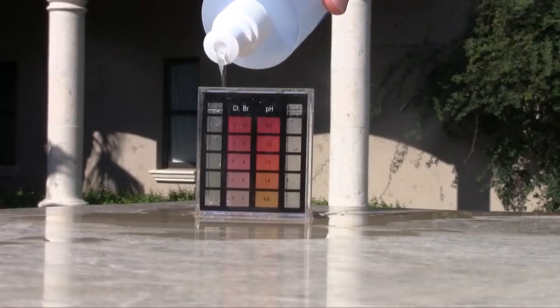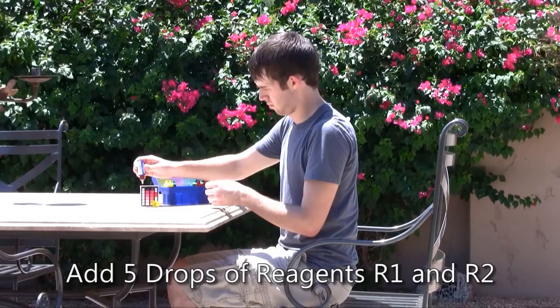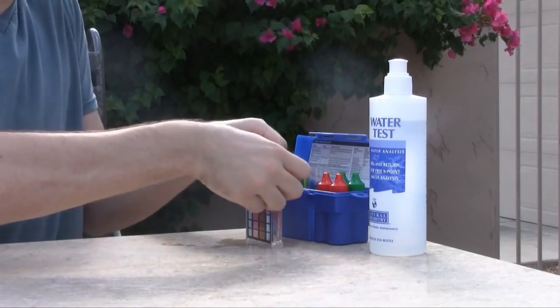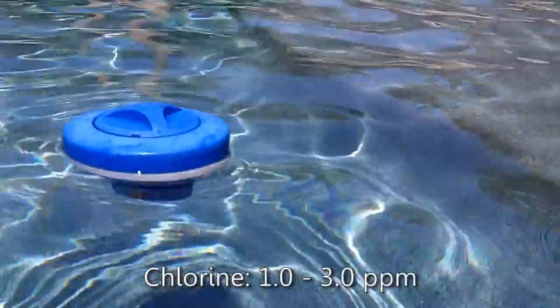You'll want to measure the chlorine in the water. Fill the smaller side of the test vial to the top line and add five drops of reagent R1 and five drops of reagent R2 to the test sample. Place the cap on the test vial and gently invert to mix the sample. Compare the color of the test sample to the color guide on the test vial. Your chlorine reading should be between 1 and 3 parts per million.